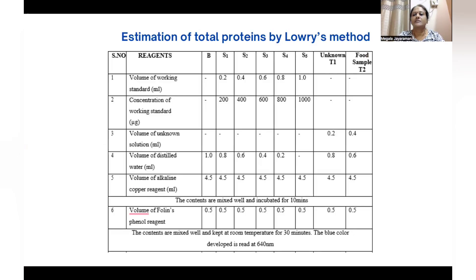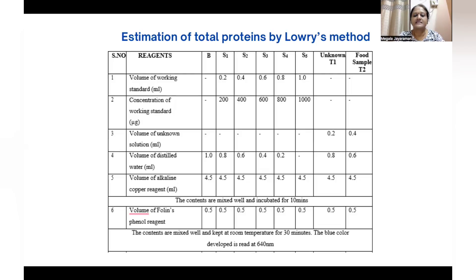Estimation of total protein by Lowry's method involves the following table. It is best for the viewers to make such a table before starting the experiment. The details in the table include: volume of working standard, volume of unknown solution, volume of distilled water, volume of alkaline copper reagent, and volume of Folin-phenol. The contents are mixed well and kept at room temperature for 30 minutes, and the blue color developed is read at 640 nanometers.